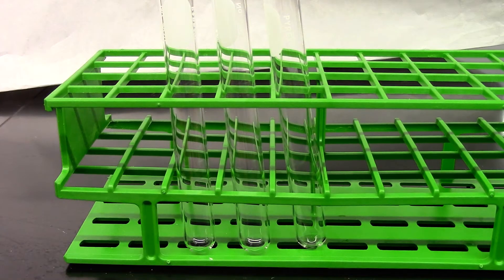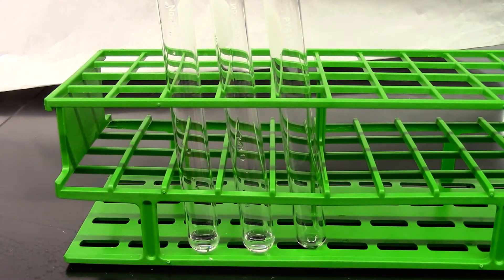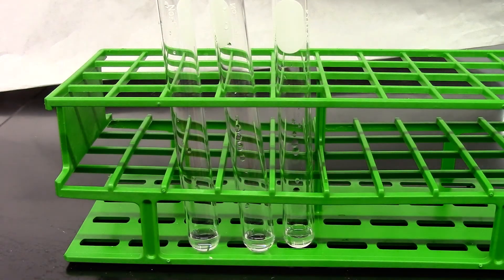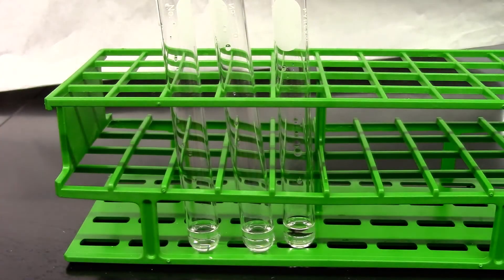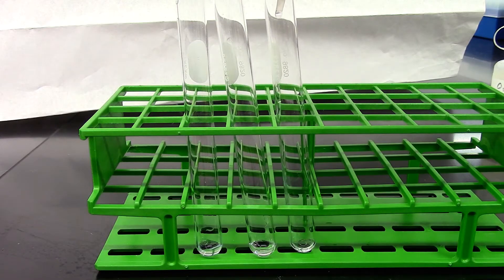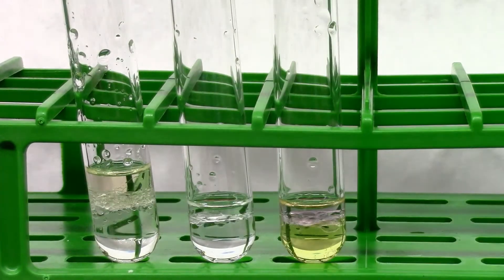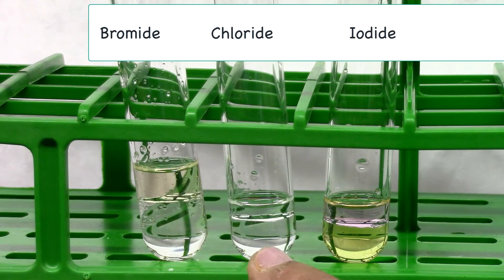For the halide test I have three clean test tubes. The first solution is bromide salt — I'll add 10 drops. The second one is chloride salt. And the third one is iodide salt. Now I'm going to add 10 drops of hexane to each of these test tubes, one drop of nitric acid to each, and five drops of chlorine water to each. I'll give this solution a mix. You can clearly see the bromide solution has a yellow top layer, the chloride solution has a clear top layer, and the iodide solution has a purple top layer.